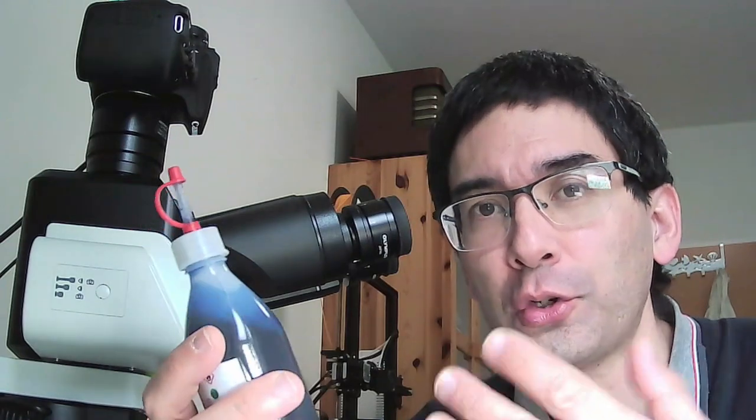using methylene blue. It's called Löffler's solution, which is not a concentrated, it's a dilute methylene blue solution, and this is actually quite the popular stain because it's a general purpose stain.